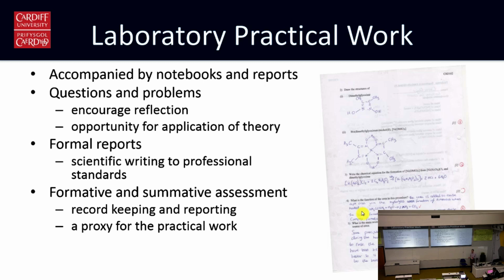And typically a laboratory practical will be accompanied by some sort of note-taking to actually record what goes on during the session, and that's generally followed up by some sort of report that the student submits afterwards. The reports have a number of purposes. They can prompt the student to think about what they've done in the lab session. It can be an opportunity for a student to apply theory, which may have been taught in parallel in lectures.